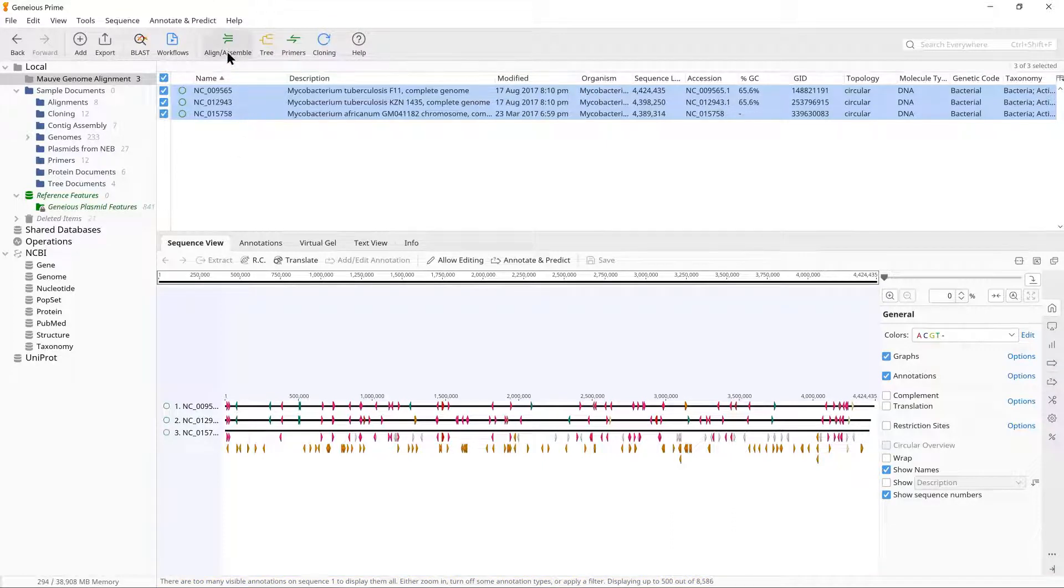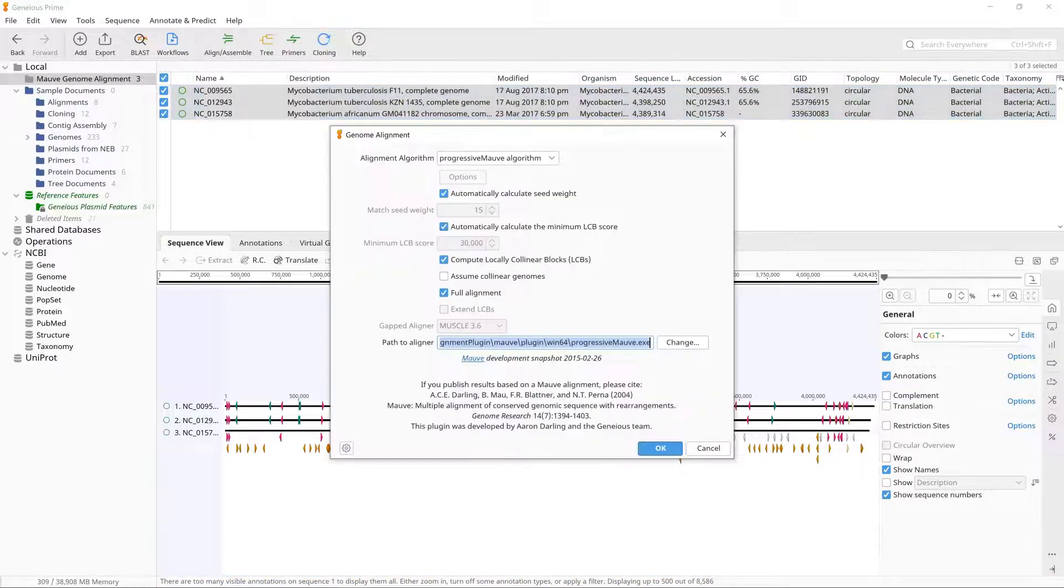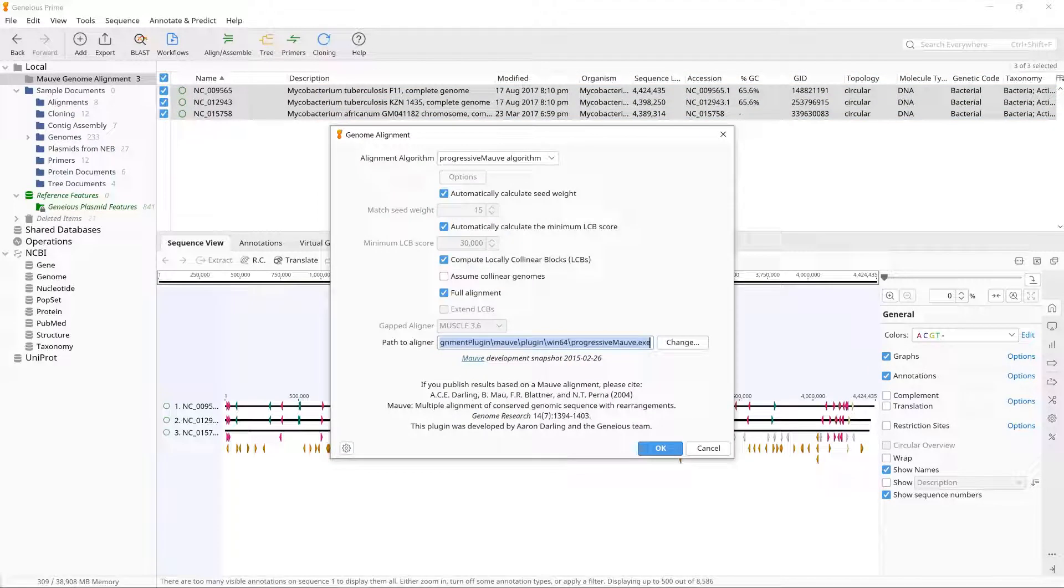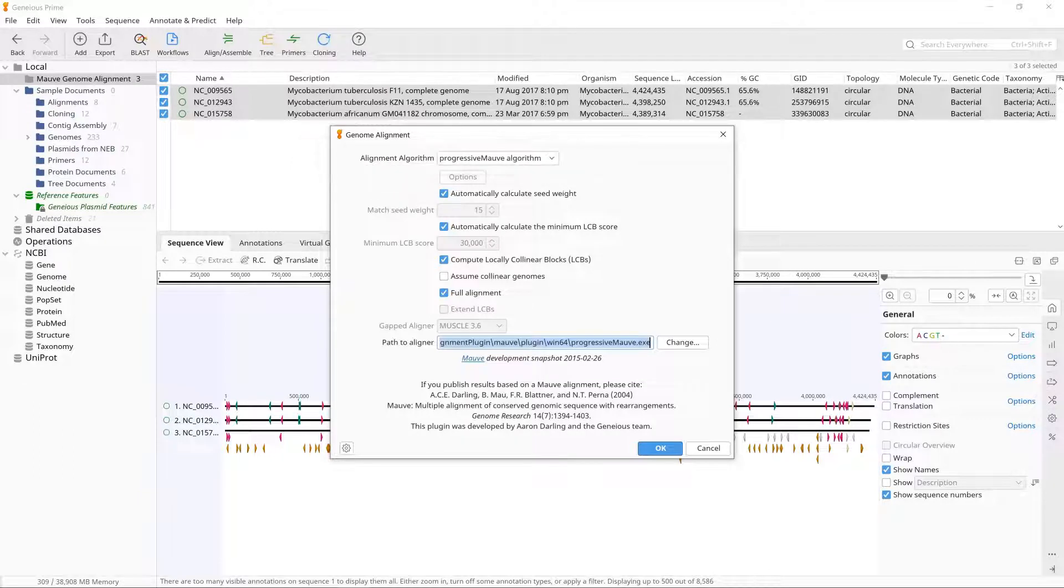Then go to Align, Assemble, Align Whole Genomes. Ensure the MOV Genome tab is selected and the algorithm is set to Progressive MOV. All other settings should be kept at the default settings.